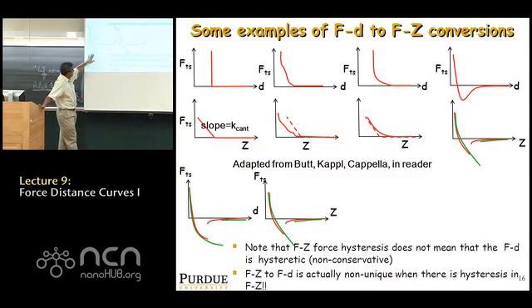On the left here is a F versus D curve, which is hysteretic. Now, in this case, it's the FD curve itself that's hysteretic. And this is, for example, in the JKR model. And this is what happens due to the necking of the atoms when you have very soft materials. The neck, just the contact, the process of coming close and moving away, the interaction forces themselves are intrinsically hysteretic, right? So tip sample gap decreases, you get a formation of a neck. You break the bonds, you break the neck, you follow green.